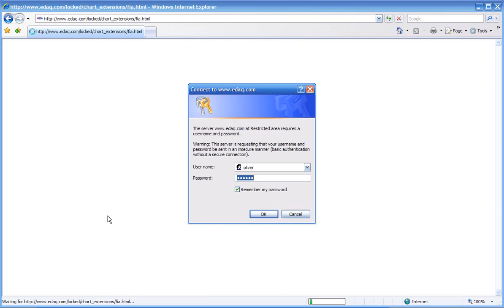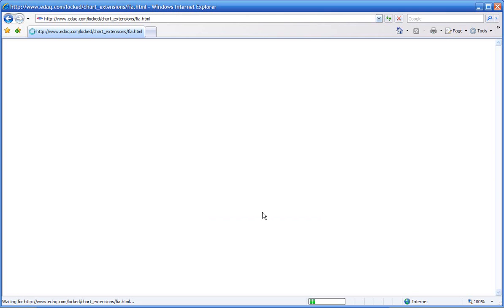In order to download this, you'll need to register with the EDAC website. You put your name and password and click OK.